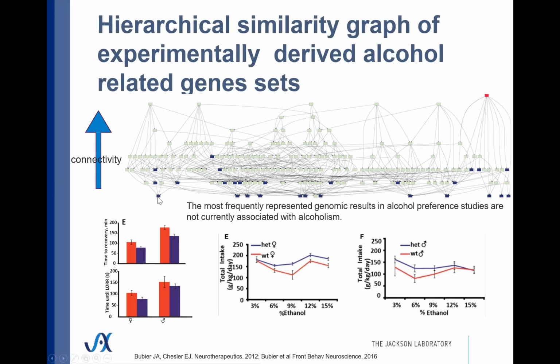And so the way this graph is set up, these are genes on individual gene lists. And on the second level of this are genes that are in the intersection of two lists. And as we go up, we're talking about genes on 3, 4, 5, and above. So the more highly connected a gene is, the more gene sets it's represented on, the higher up in this graph it's represented. So this node represents multiple gene sets containing genes that are connected to all of those sets. And in this case, the number of sets is 6.